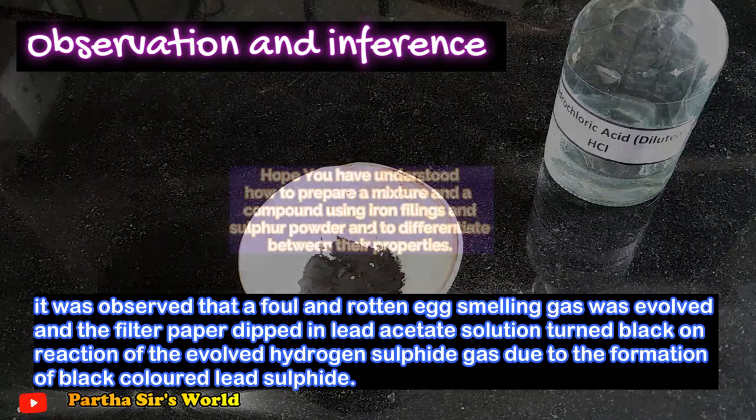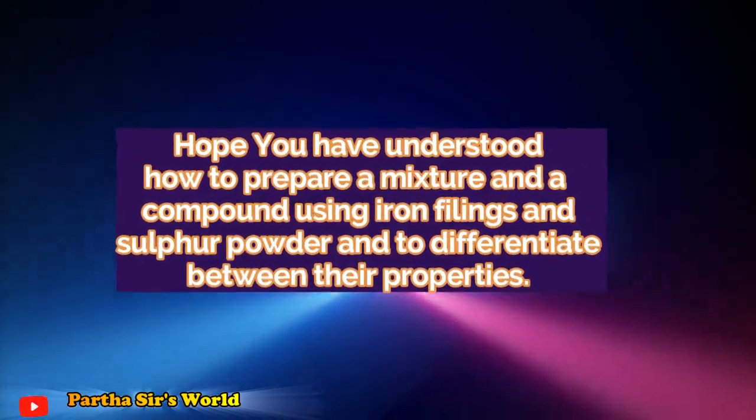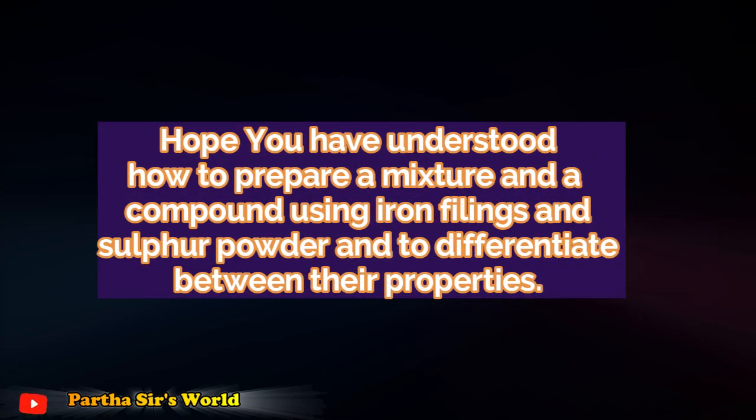Hope you have understood how to prepare a mixture and a compound using iron filings and sulfur powder and to differentiate between their properties.